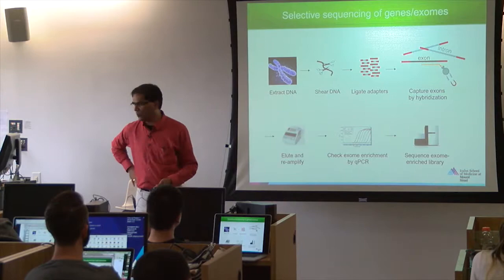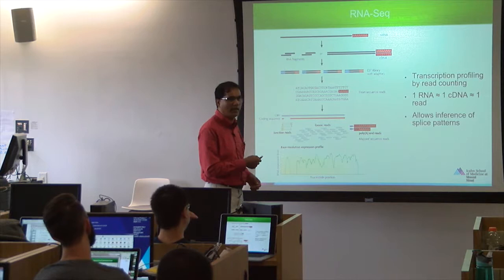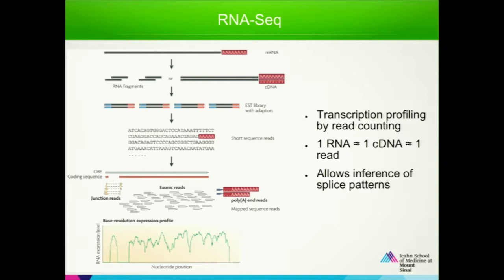What if I want to sequence the RNA? Same thing. You convert it into cDNA, fragment it, and attach adapters again. Same concept as differential display, where we added Y-shaped adapters. You use this over and over again. Adding those adapters is essential, because you use one to stick to the lawn and another as a primer for sequencing. And then you align and study.